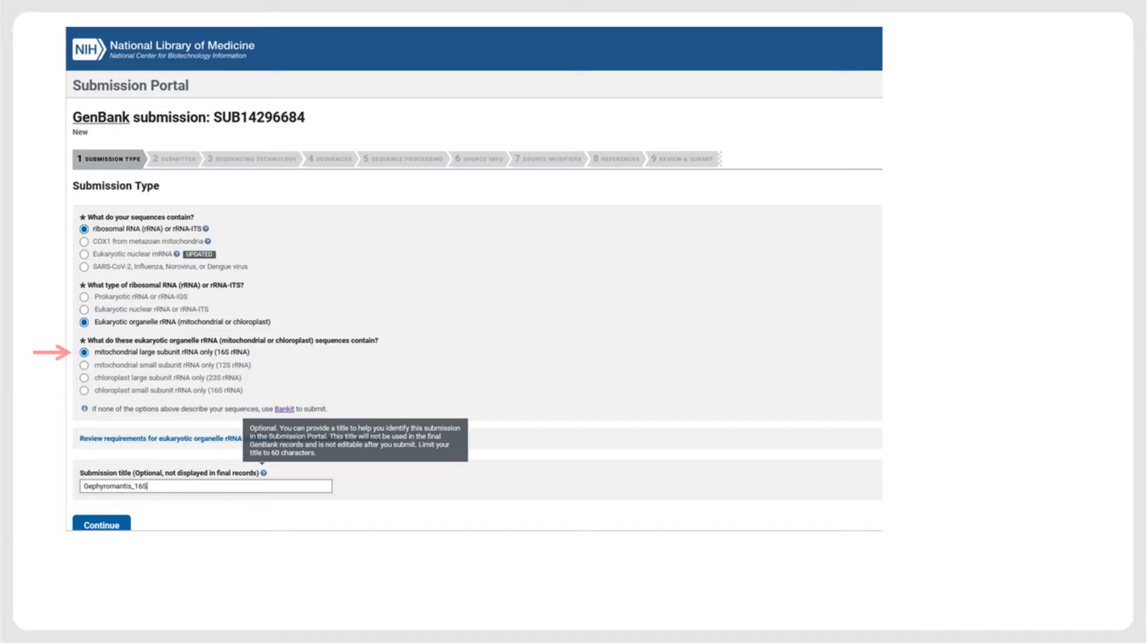In our example, we have sequences of the mitochondrial large subunit RNA gene, that is, the 16S rRNA.